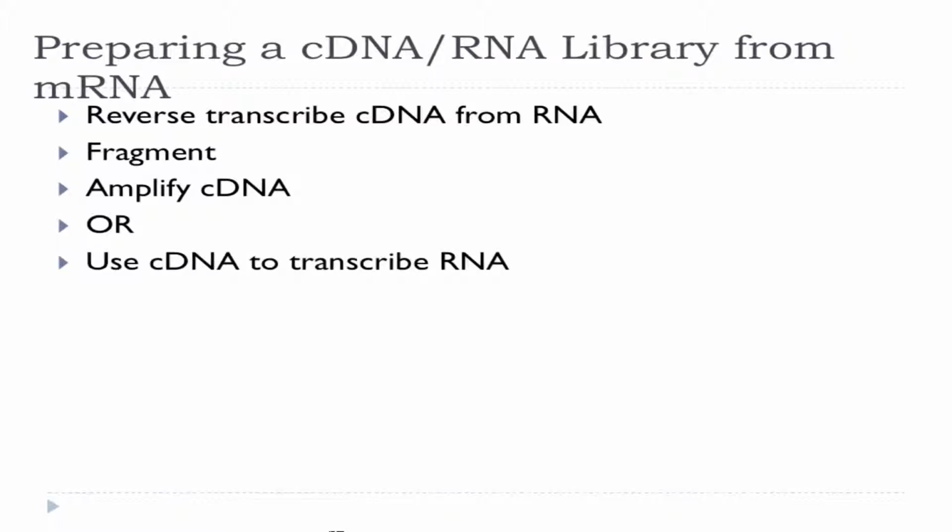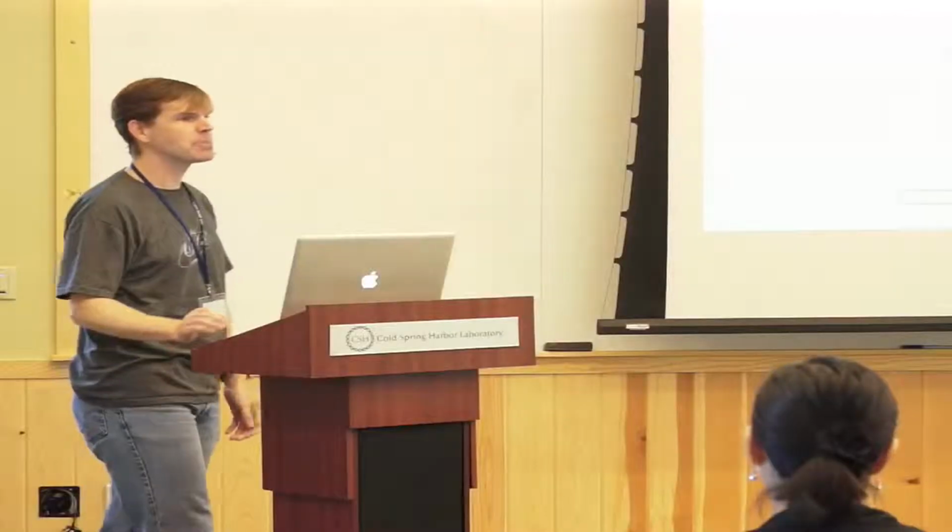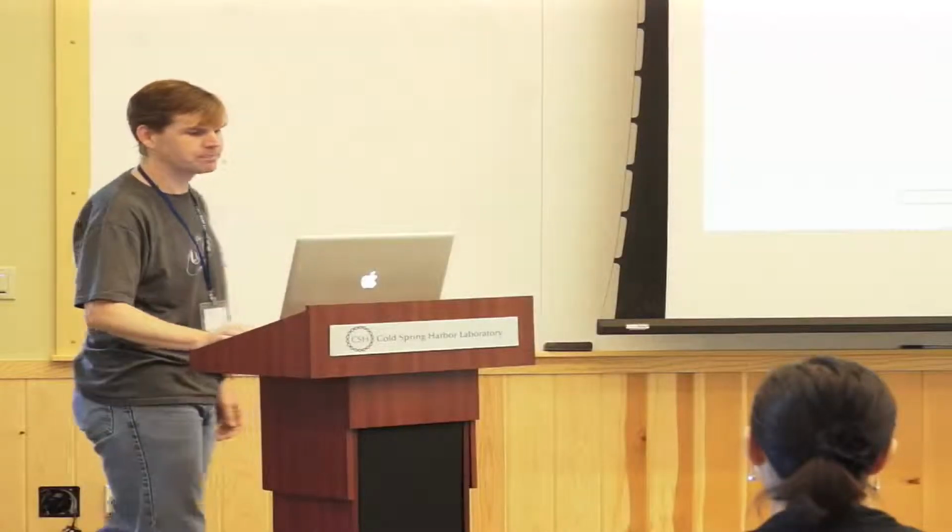Sometimes we have genes that we totally missed, we didn't even know they existed. Sometimes we have genes or probes on the array that were supposed to work for a gene, but when you look at the data, they can't possibly be measuring anything of biological importance. So hybridization helps us, but it also hinders.